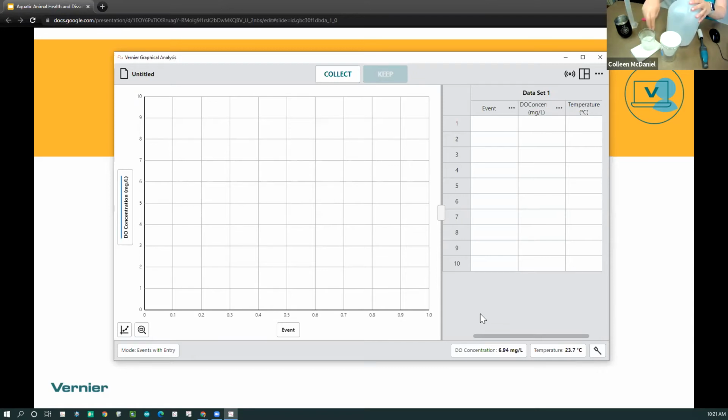And then I'm actually going to grab a couple little ice cubes here and put that in there as well, just to make sure we have good cold water in there. Now, once I have done that, I am now going to shake this for 2 minutes. So I'm going to set up a timer and I'm going to start shaking.